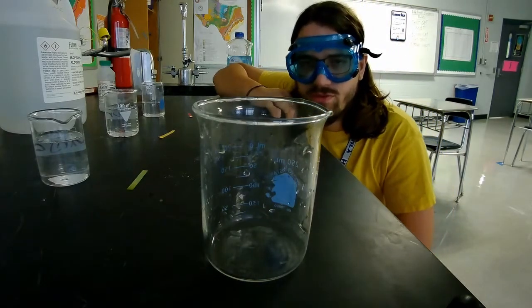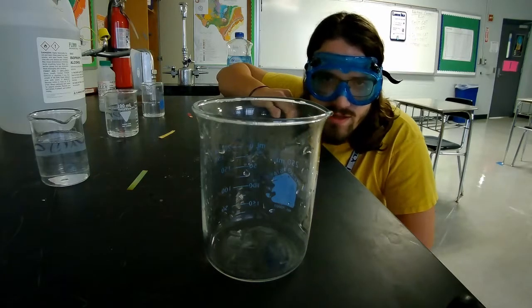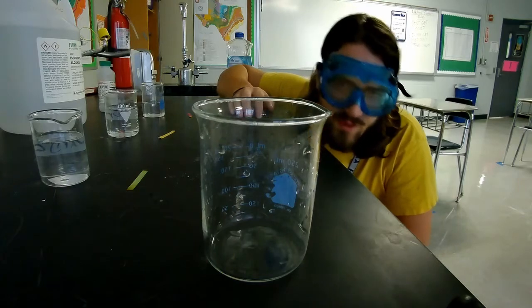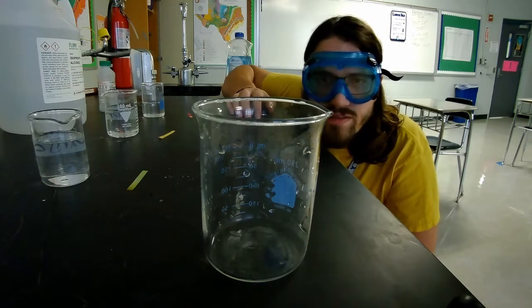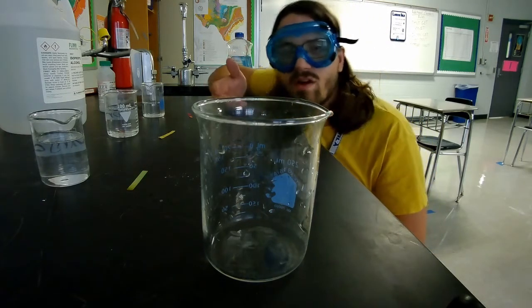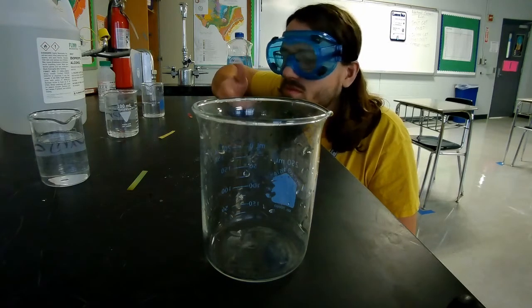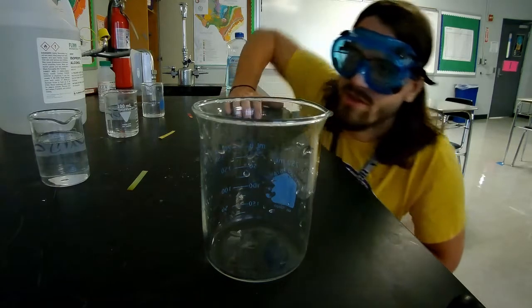Alright, so this is going to serve as our chemical reaction beaker, and you'll be able to keep an eye on any changes. Any changes in smell or in appearance I can help describe to you, and hopefully anything else that happens you will be able to see. So let's start out with our strongest base, which was ammonia, and our strongest acid, which was hydrochloric acid, and let's see what happens.